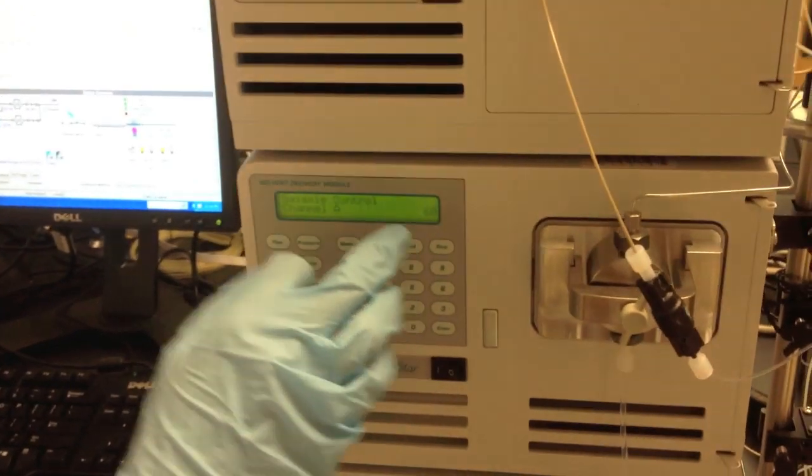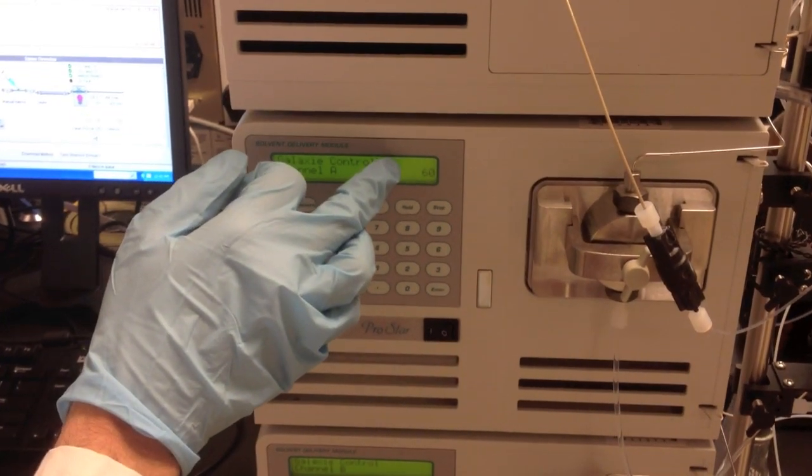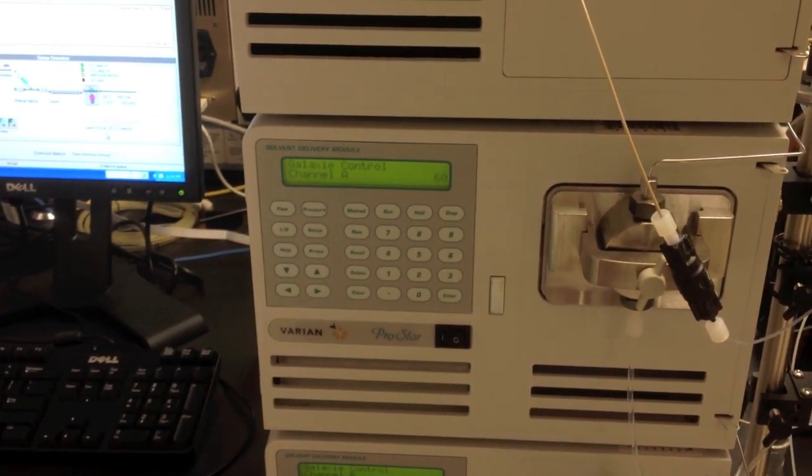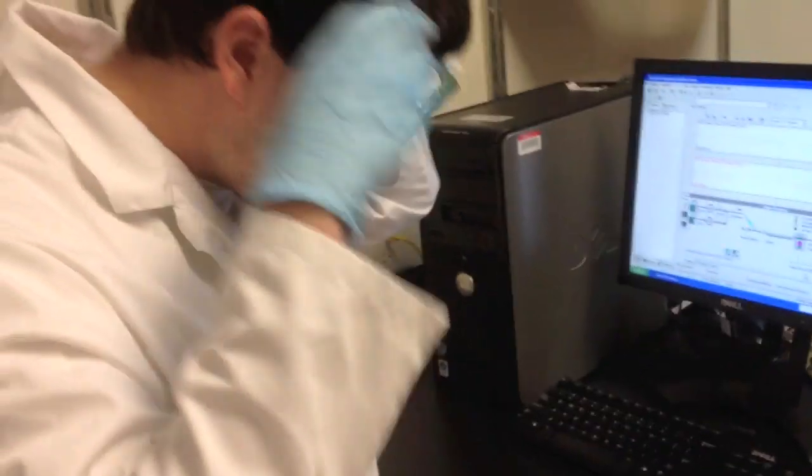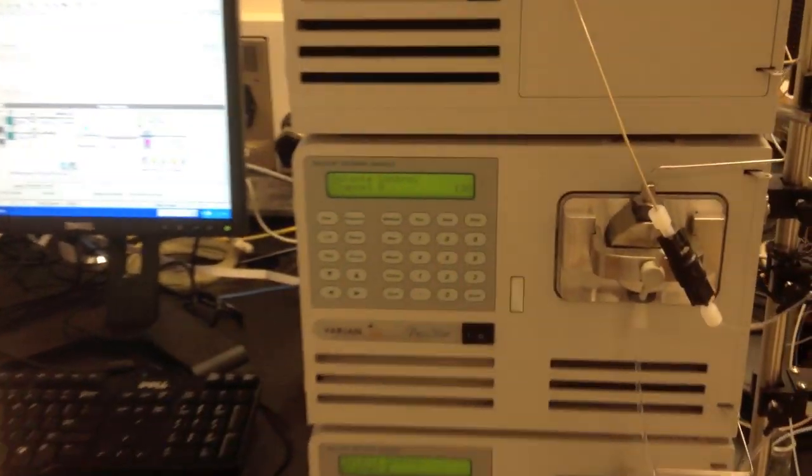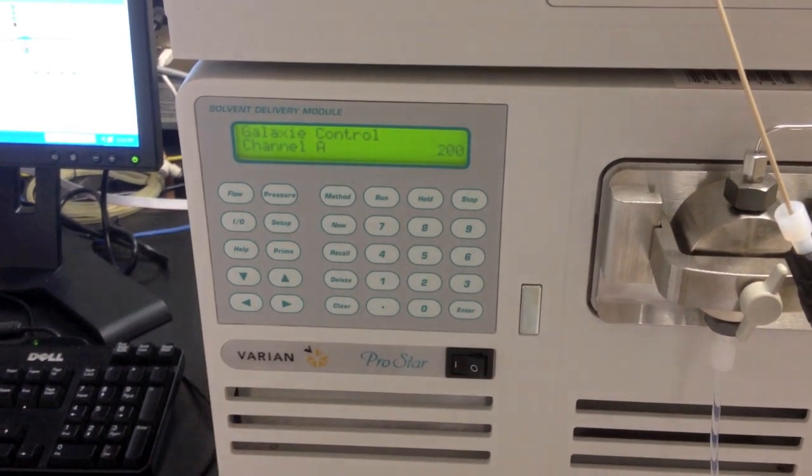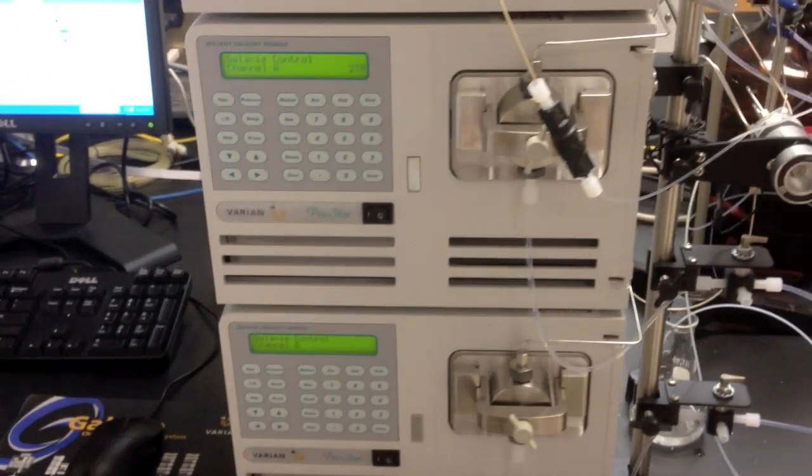So we have to keep an eye on the pounds per square inch. That'll start going up pretty quickly. So at this point, we've got to put on our goggles. This machine will get up to 1600 psi and that's a lot of pressure. So it's rising pretty quickly. So we're going to go prepare our sample.